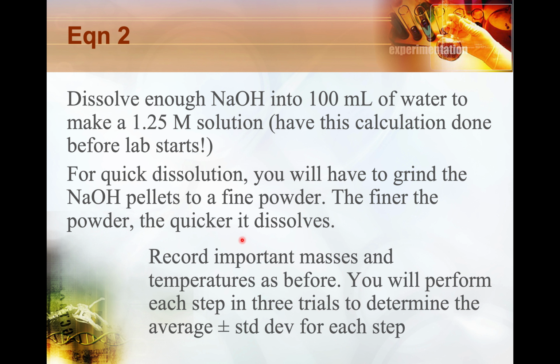And as I said before, it's run effectively in a similar way. You'll get the mass of the cup, the mass of the solution, you'll get the initial temperature, you'll start monitoring the final temperature for some time, and then once it seems to be done, then you can get the mass of the full cup.